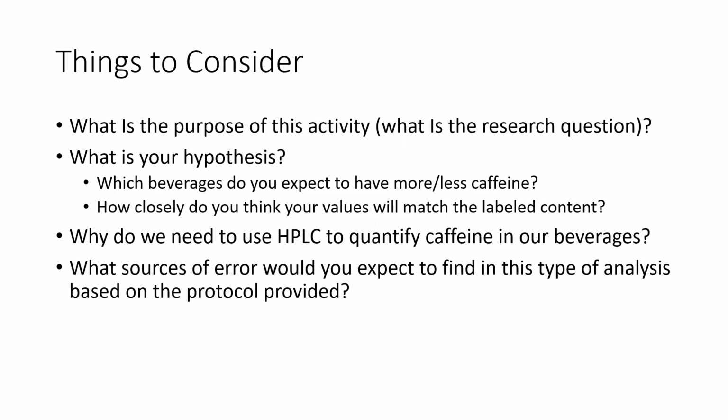Things to consider while you're watching this lab and listening to this lecture. Think about what's the purpose of this activity. What's our research question here? Why do we need to perform HPLC to separate caffeine in a sample? And what's your hypothesis? So if we have our 4 different beverages, based on your knowledge of those beverages or based on their labels, which ones do you expect to have more or less caffeine? And how closely do you think the values we determine in lab are going to match the label content of caffeine? And like I said, why do we need to use HPLC to quantify caffeine in our beverages? Why can't we just throw it in our spec?